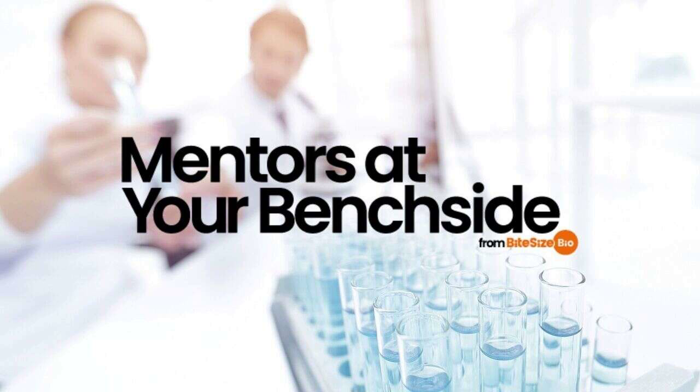Tissue staining is a fundamental technique used in histology to enhance contrast and visualize cellular and tissue components. Among the various staining methods, hematoxylin and eosin staining is probably the most widely used. So why do we need to stain tissues? Once a tissue specimen has been processed by a histology lab and transferred onto a glass slide, it needs to be appropriately stained for microscopic evaluation.